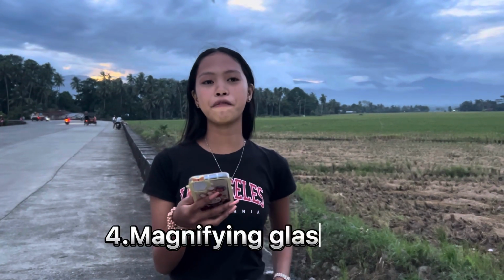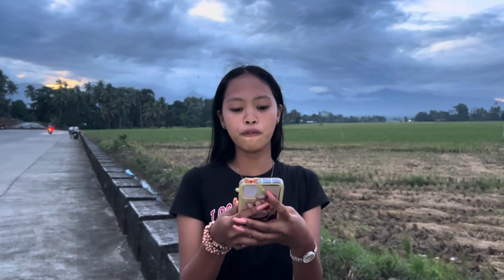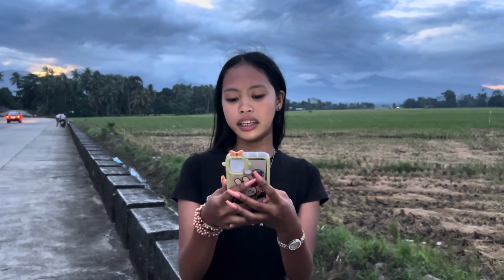Fourth, magnifying glass. A magnifying glass is one of the first lab equipment introduced to students. As the name suggests, it is used to view an enlarged or magnified image of objects, or read the small subcalibrations marked on many equipments. It has a convex lens for object enlargement, and usually has a wooden handle to hold it.